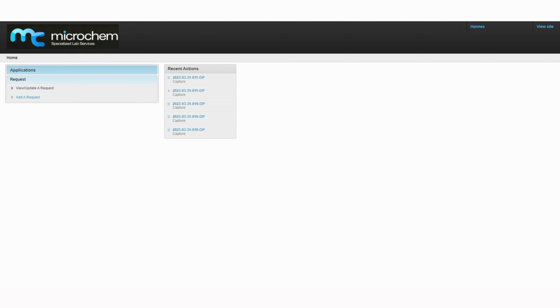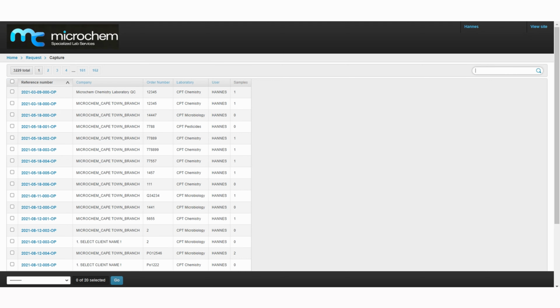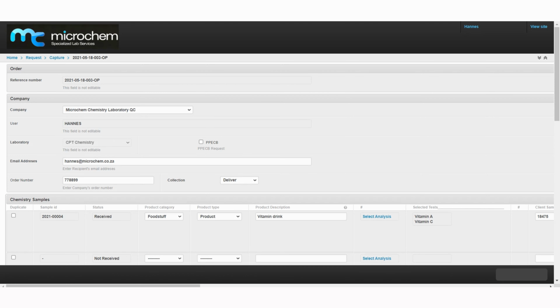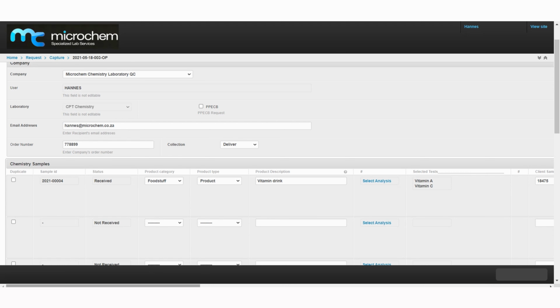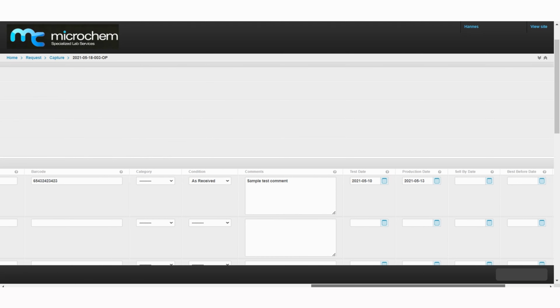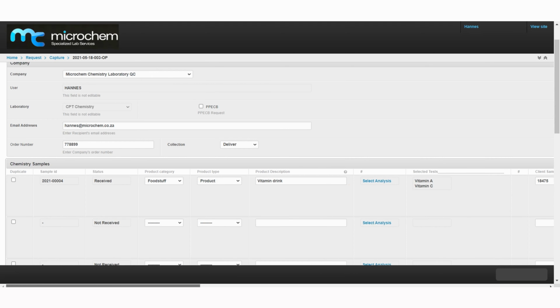You'll also have the option to have a look at previously submitted requests. Going back to the home page, if you select View or Update an Analysis Request, you'll be presented with a list of previously submitted requests. Simply click on either one of the requests, and this will bring up the previously captured information for reference.